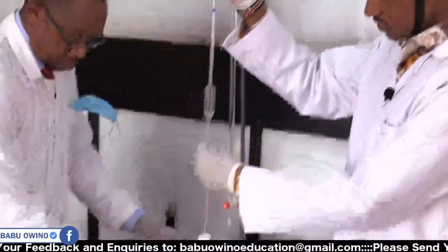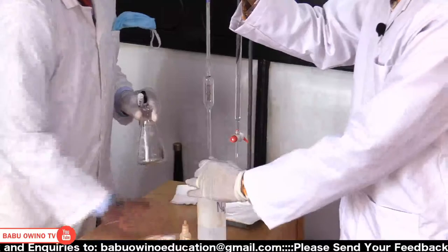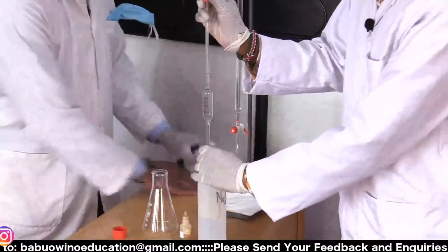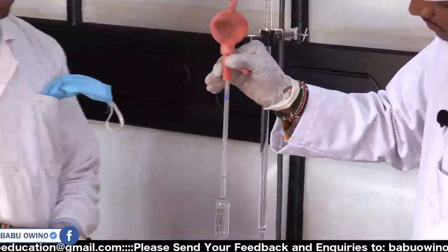Then you put the pipette inside the sodium carbonate. Then you hold it from here. Then you press this part of the pipette to fill it, to suck.